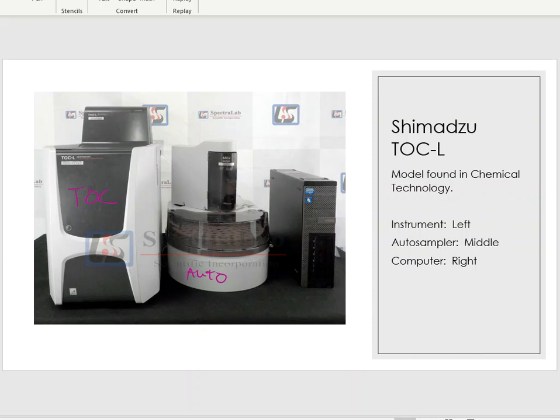Here is a picture of the full TOC setup. On the left is the TOC instrument box itself. In the center is the auto injector (auto sampler), where samples are loaded and injected one by one. On the right is the computer unit running the TOC software. Our lab uses the TOC-L from Shimadzu with an ASI auto injector unit and a Dell computer with dedicated TOC software.